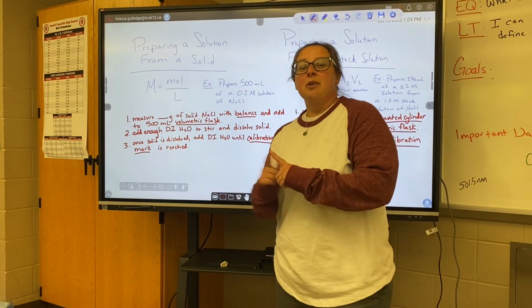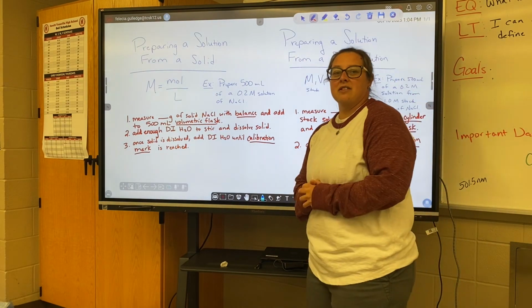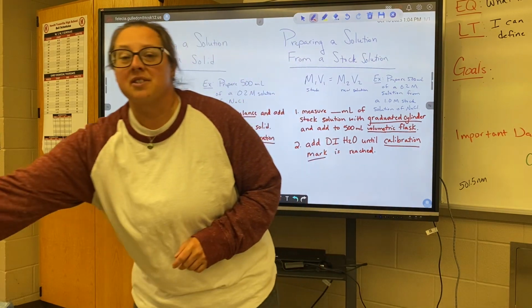Hey guys, so I'm going to do a quick video on how to prepare solutions. There's two different ways that we can prepare a solution. The first is preparing a solution from a solid.